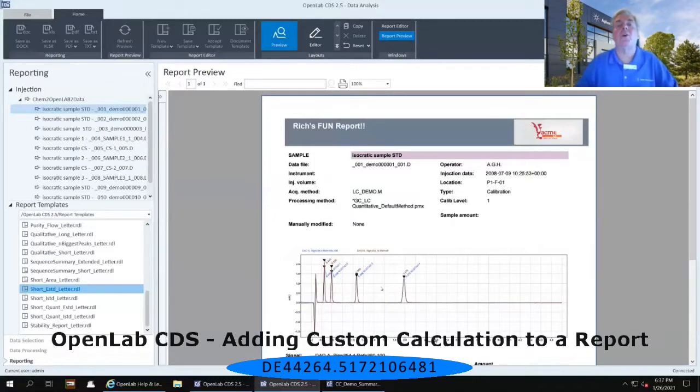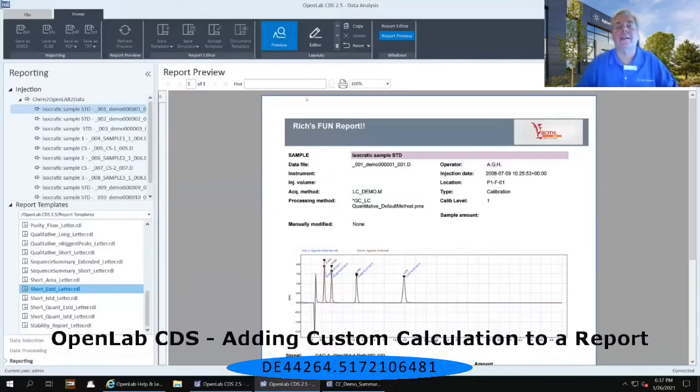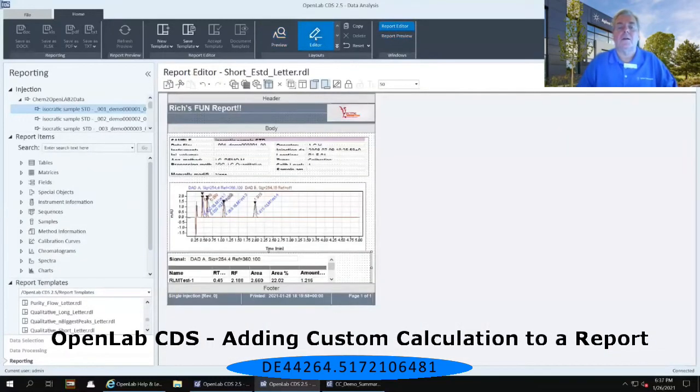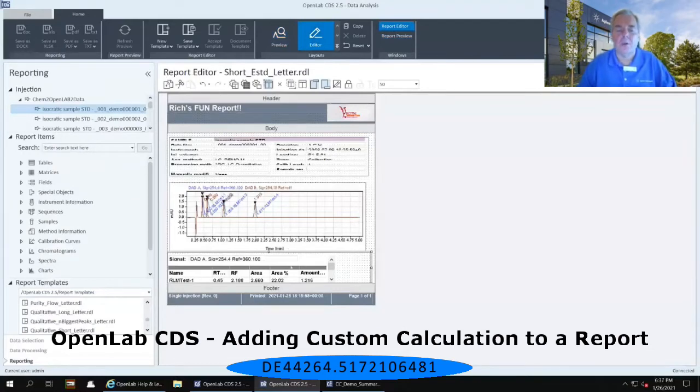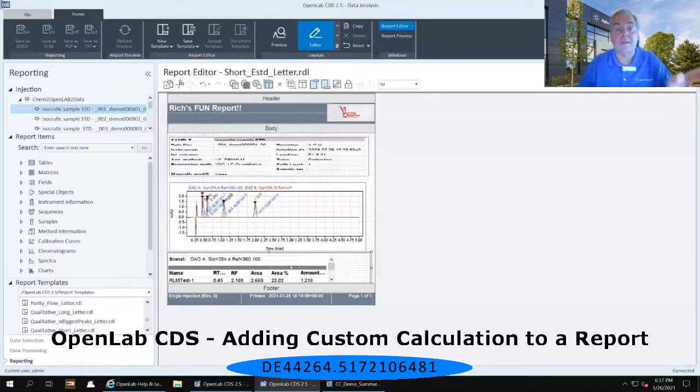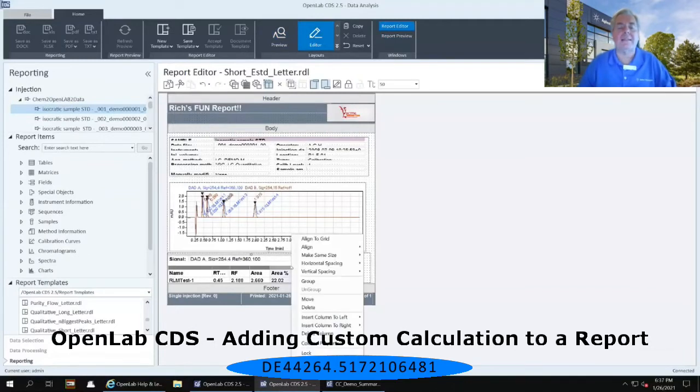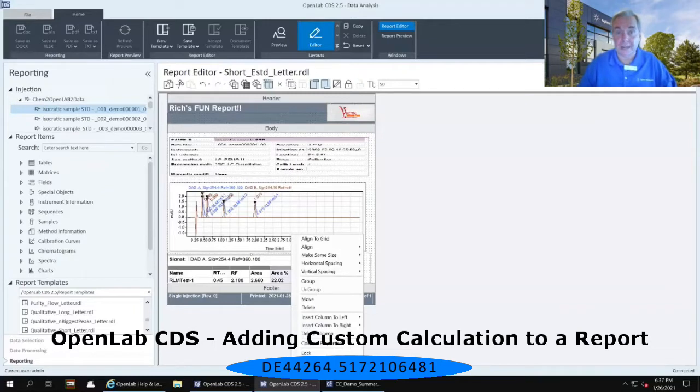So to do that, go back to your editor again. Right mouse click inside of the table that begins with your name, the names of each one of those peaks, RLM test 1, 2, 3, 4. Right mouse click inside of that table and go down to the properties of the table.